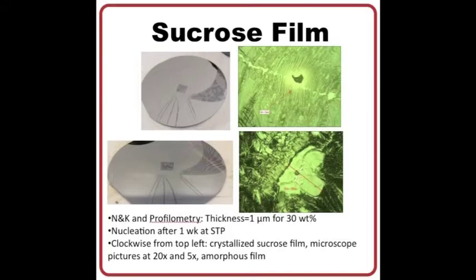Yeah, we use X-ray diffraction because the crystallized size will depend on dissolution rate. So if we have different concentrations of the sucrose films, then we can know how the crystallized size affects the dissolution. The smaller the size, the faster the diffusion rate.